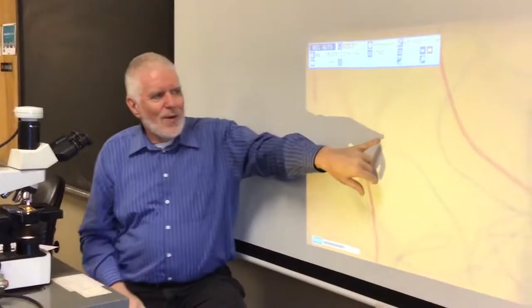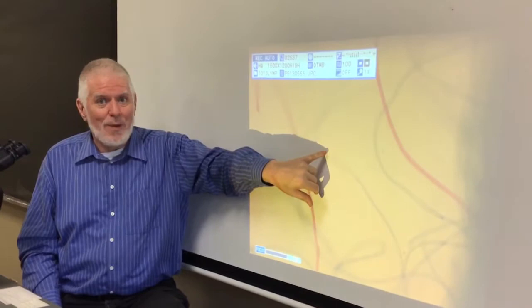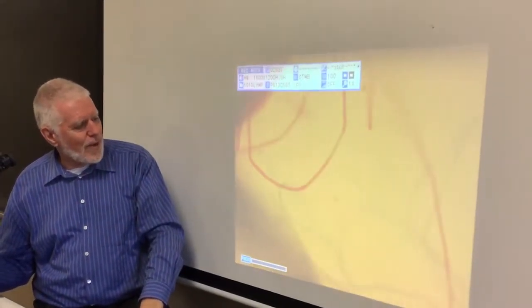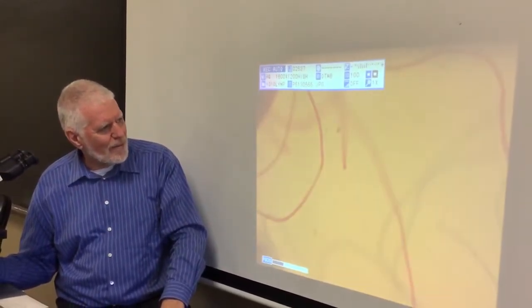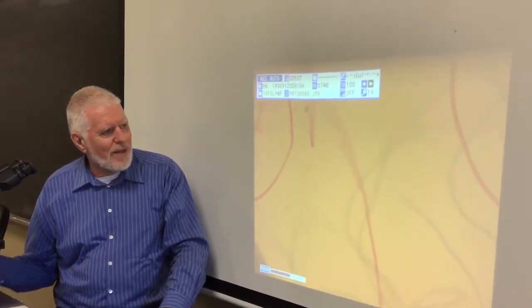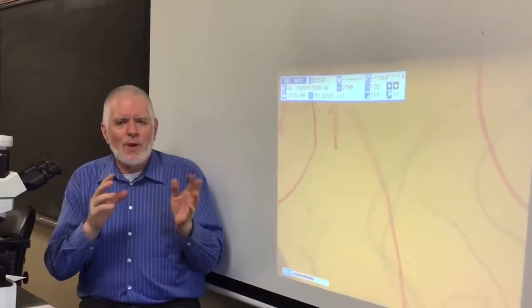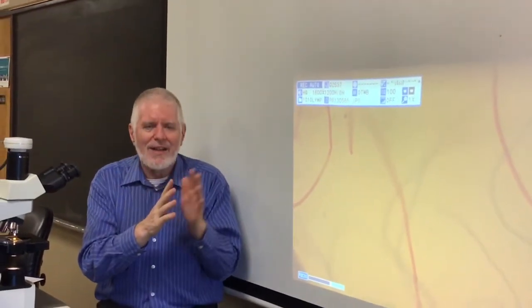And so what we had in the middle of the screen was the space between the threads. That's pretty much what we have now. If I move the slide, there's the green thread, and there's the red thread, and there's the yellow thread. It looks brown under the microscope. But what that means is, if you've got a big space in the middle of what you're looking at, and you go up in power, all you're looking at is the space. Whenever you go up in power, take something that you can see, usually really well, move it into the middle, then go up in power and focus on that.